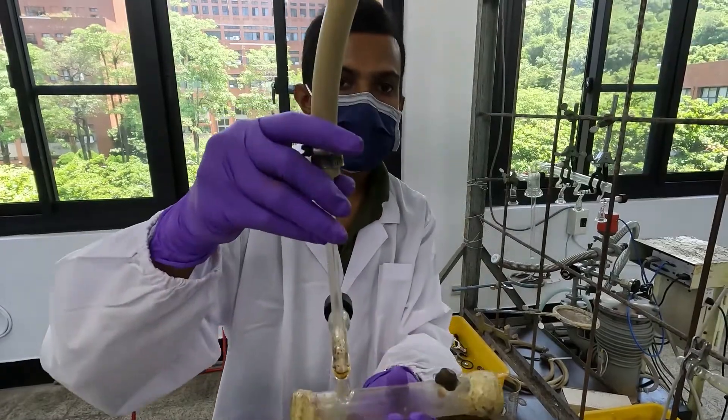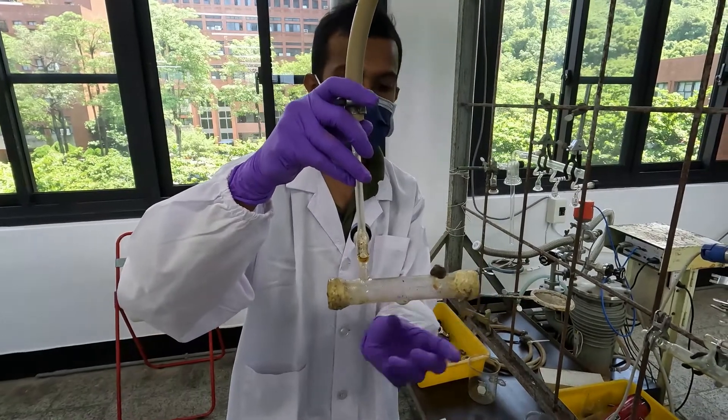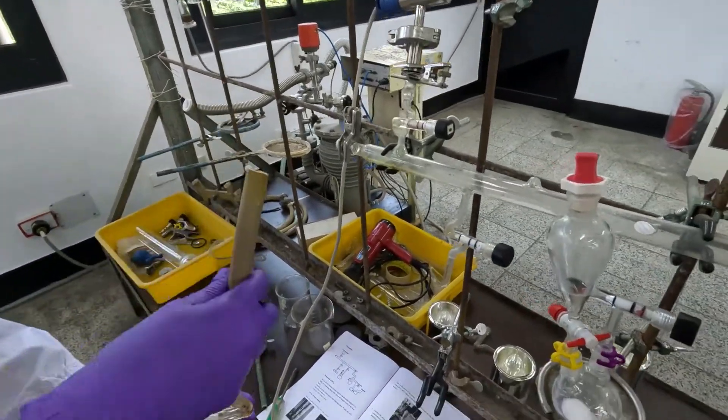This is the IR cell. Make sure not to touch these two sides. Now, I am going to fix this IR cell to the experimental setup.